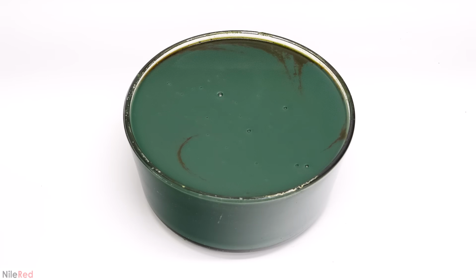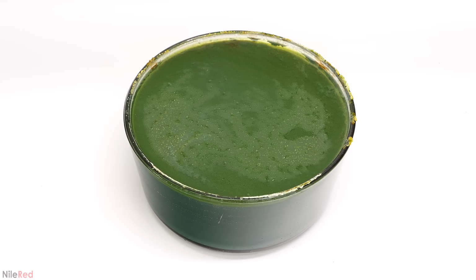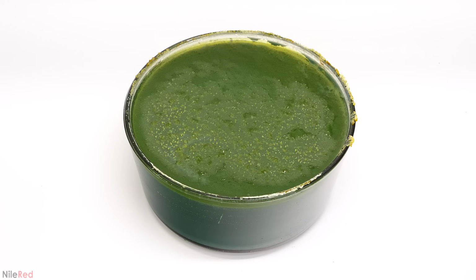At this high pH, all the chromium had been converted to chromium hydroxide, but this can also cause some of the chromium to redissolve. So unfortunately, I wasn't able to just filter everything off and throw away the water, and I had to evaporate it. Adding the hydroxide caused everything to heat up again, and as it cooled, a bunch of salts crystallized on the surface. This was kind of a bad sign though, because it meant that evaporating it was going to take forever.